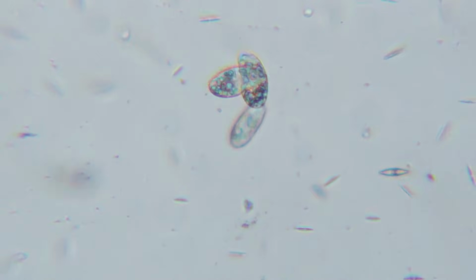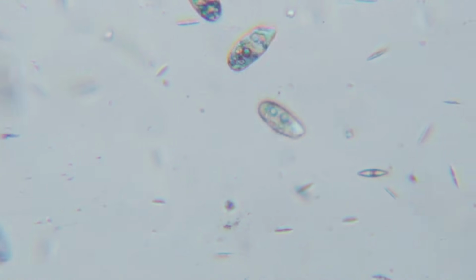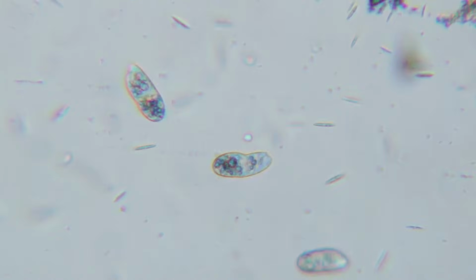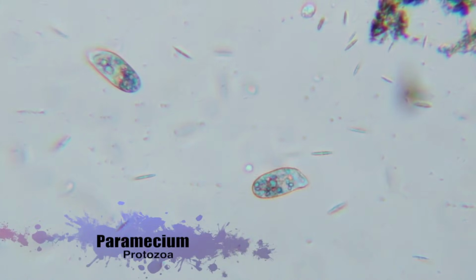Now that tadpole was about 3 millimeters long. Now these guys are about 0.1 millimeters long. It is called Paramecium and it is a Ciliate Protozoa.